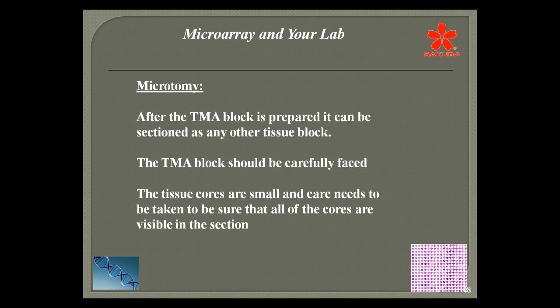Microtomy. After the TMA block is prepared, it can be sectioned just as any other tissue block. You should carefully face it. Remember, these are going to be tiny cores, so you should treat it like cutting a tiny biopsy. You don't want to face into it too quickly, or with a lot of depth, so that you cut away your little cores because they are very tiny. So you should not have any trouble.